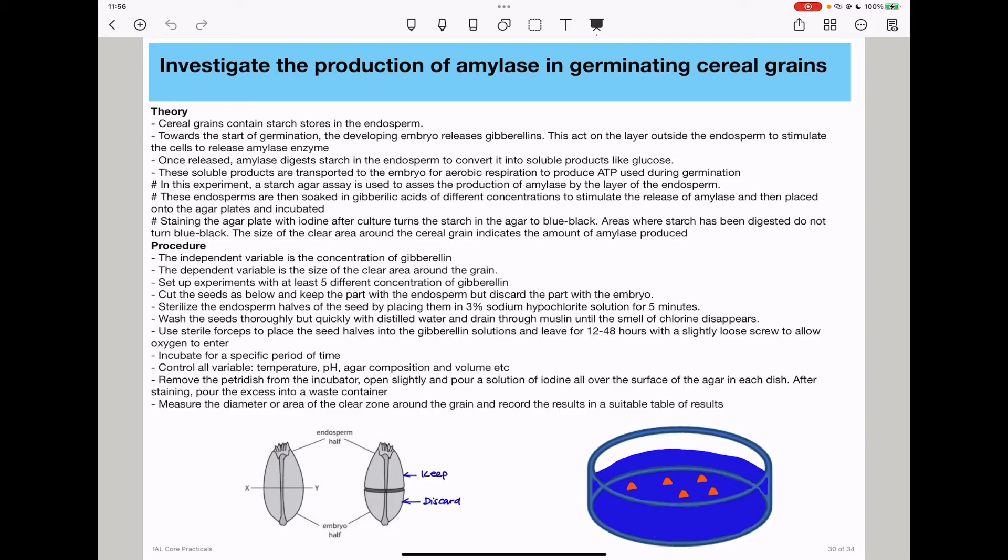Place them onto the agar and incubate for a specific period of time. Control all variables like temperature, pH, agar composition, and volume of agar. Then remove the petri dish from the incubator.